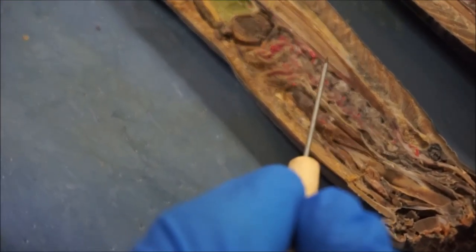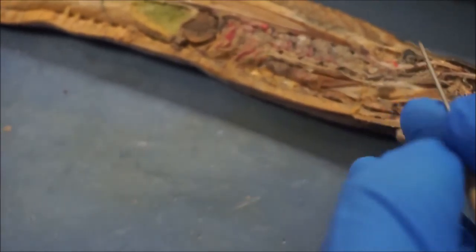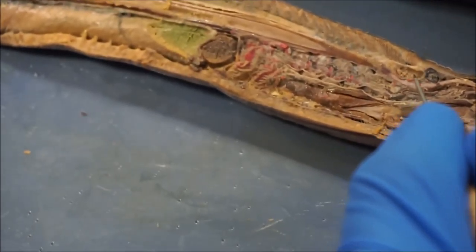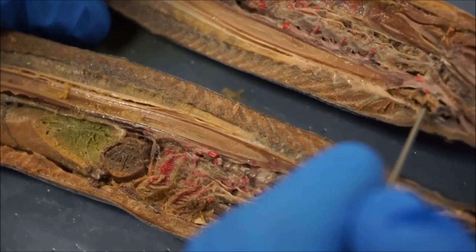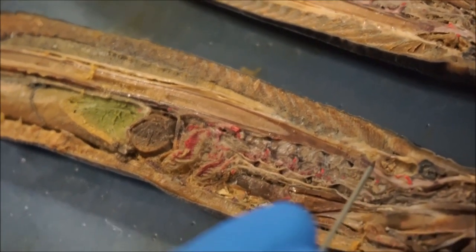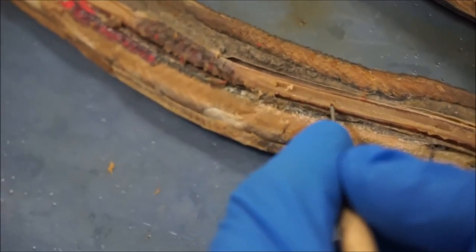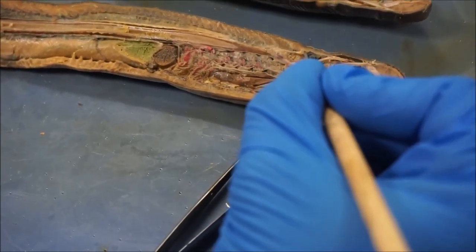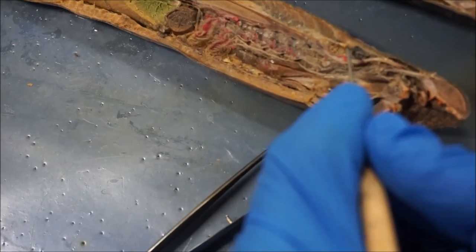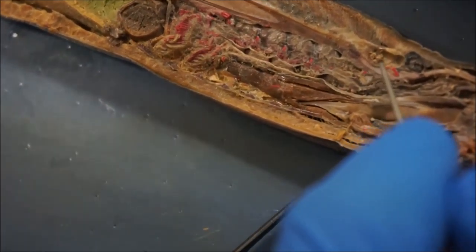Next we're going to be doing the nervous system. The lamprey itself doesn't have that much in terms of nervous and sensory organs. To start off, we have the brain, which usually is in this pocket. You can actually see the brain still in here — we have cut it apart a little bit. After the brain, it goes straight into the spinal cord, which travels all the way down, right on top of the notochord. The only other organ it has is a pineal gland up here, which is just for excreting some extra chemicals to help with the brain.